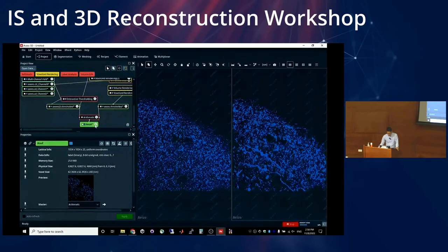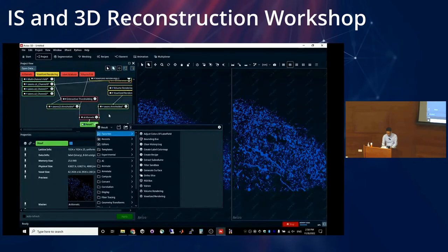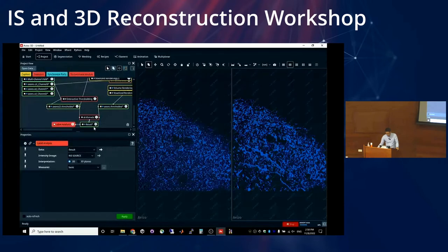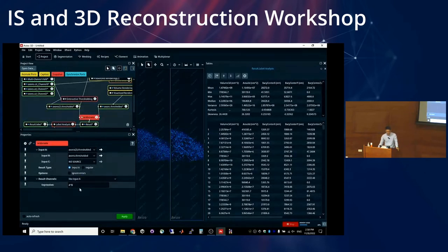And just like before, I want to do the analysis on this one, because that's bottom line what I'm interested in. Did that make sense? So if you now want to do the other channel as well, like the other chemical, you can do the same thing, right? Like do the thresholding, and in this arithmetic, it's going to be A times B times C, if you want, like where all these three intersect.